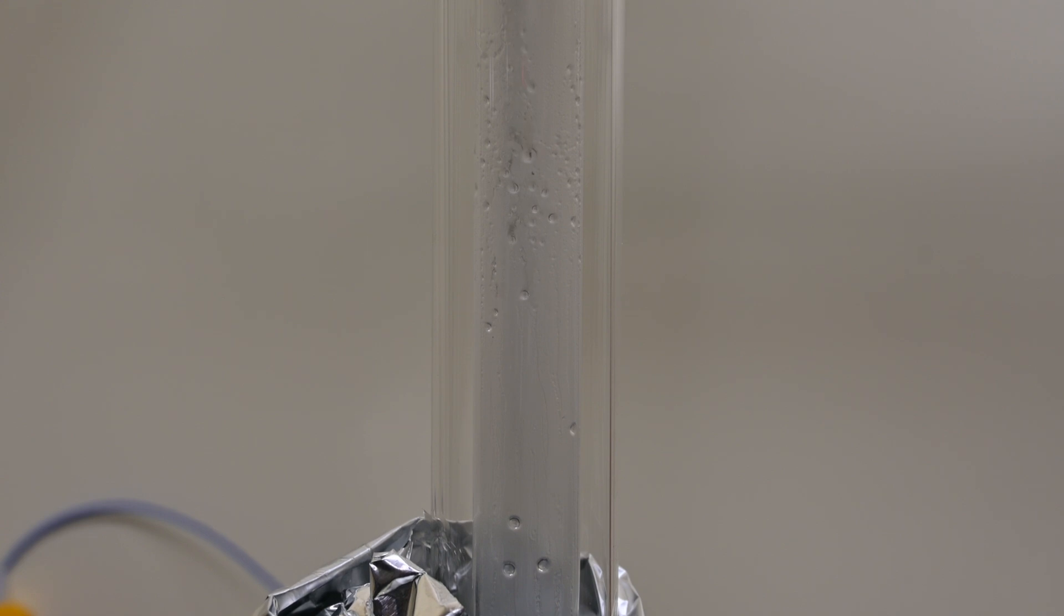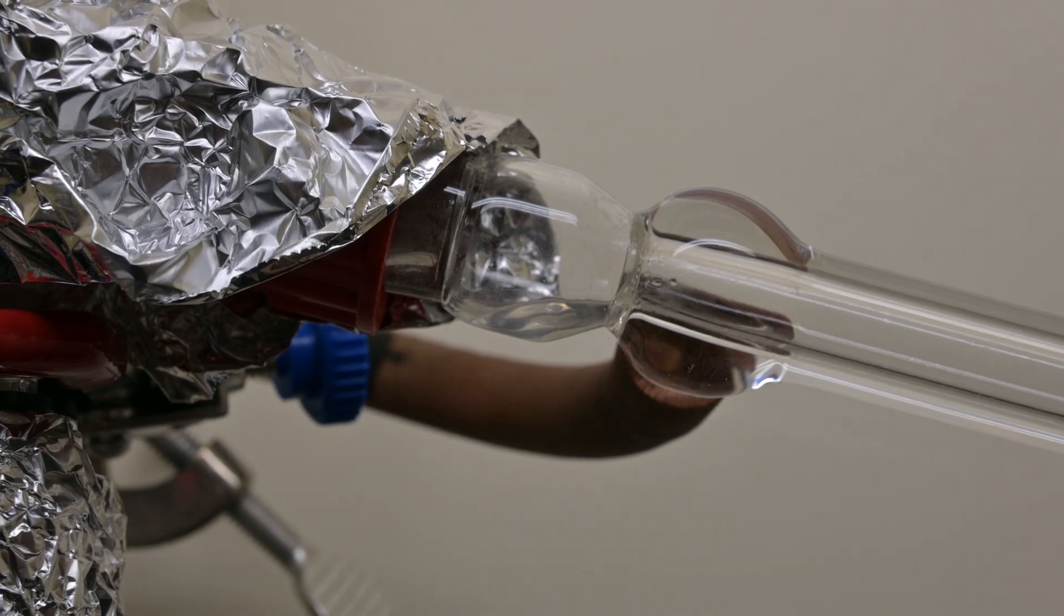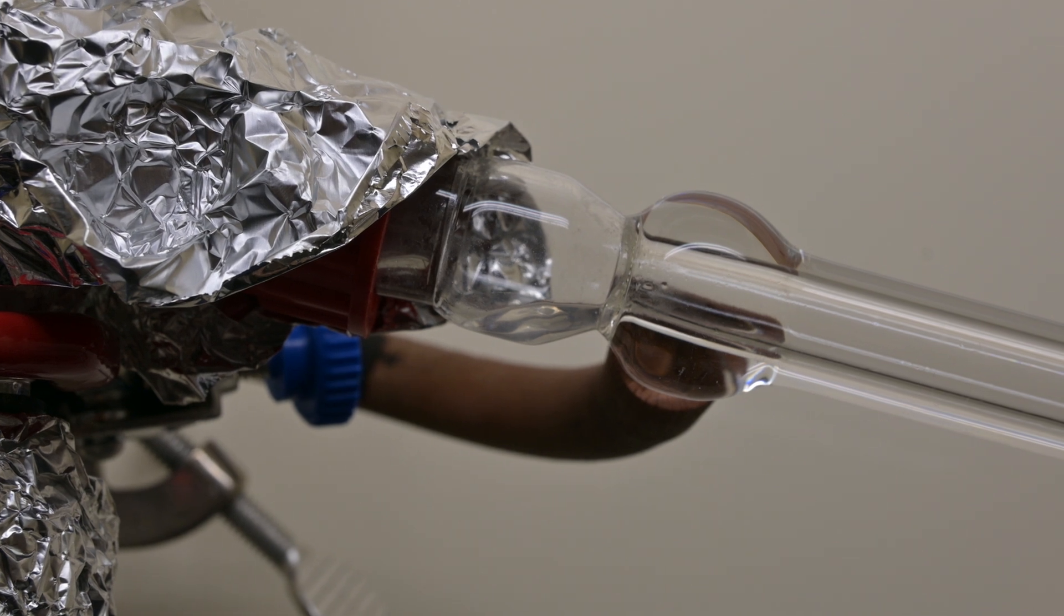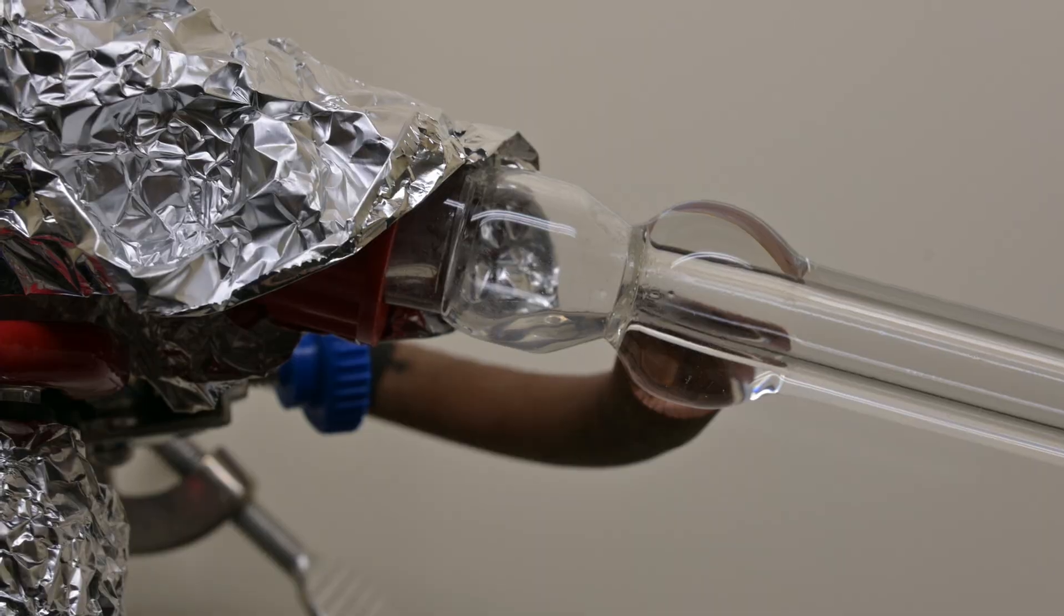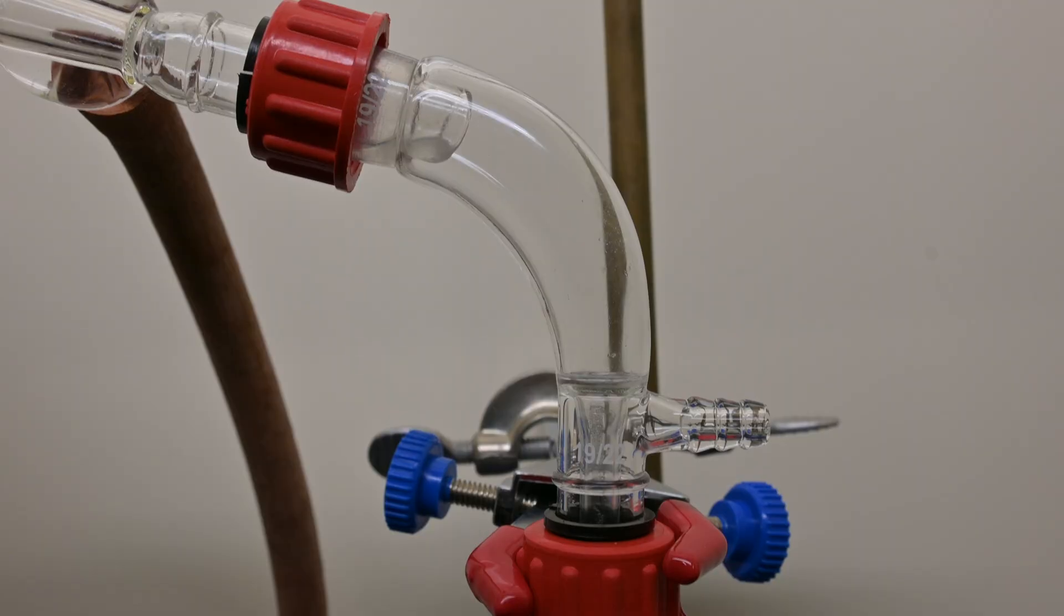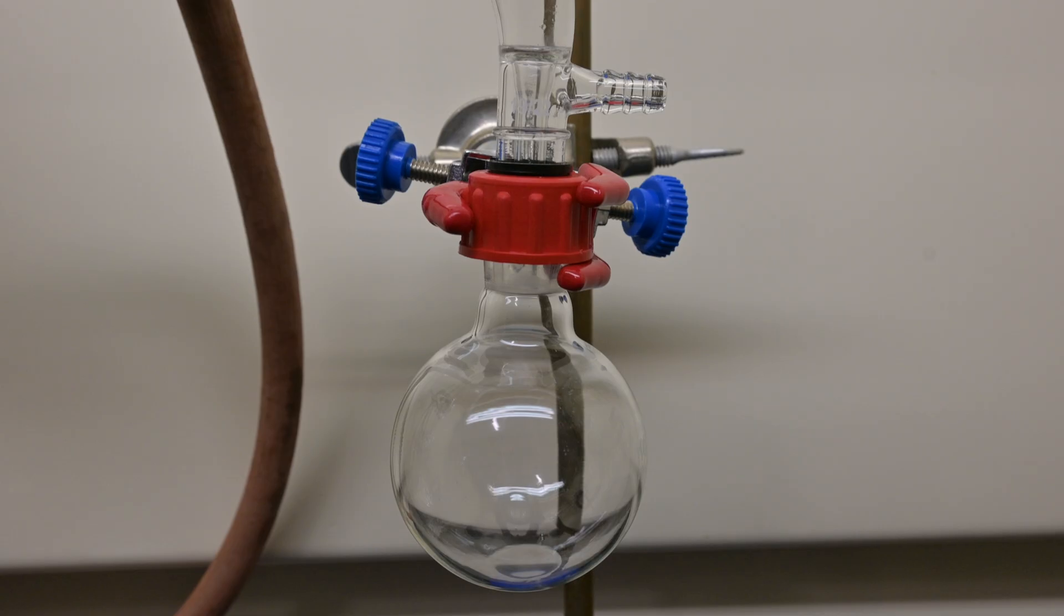We collect anything that comes over to the collection flask at around 145 degrees Celsius. Anything below this temperature will not be our styrene, and anything after this temperature range will also not be our styrene. You may have noticed I had to wrap the column with some aluminum foil. This was because it was condensing and was not making it over. The foil helps to keep in heat and allow the temperature of the column to increase till we get our boiling range that we want.